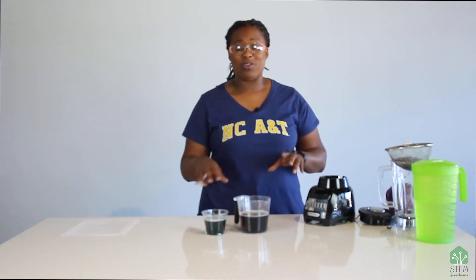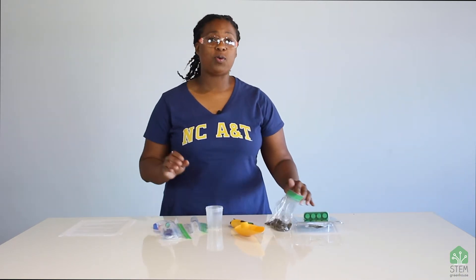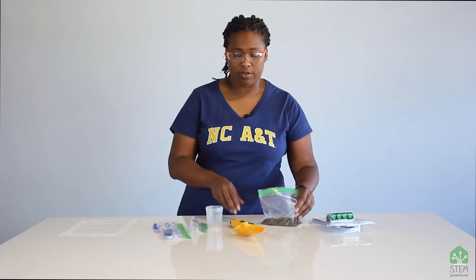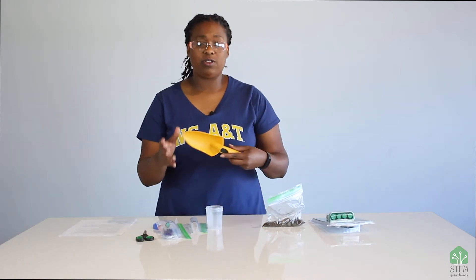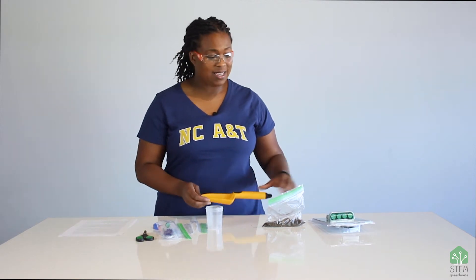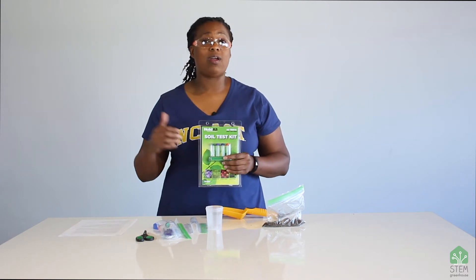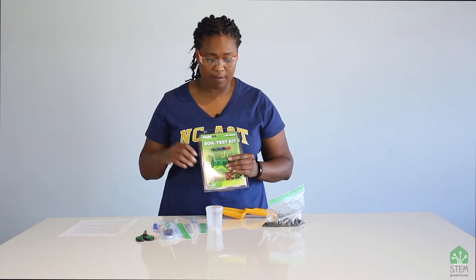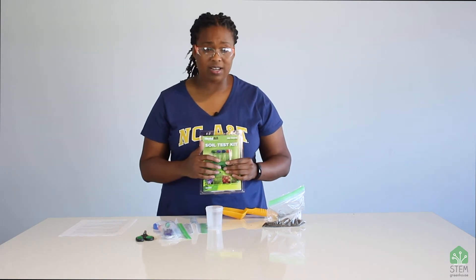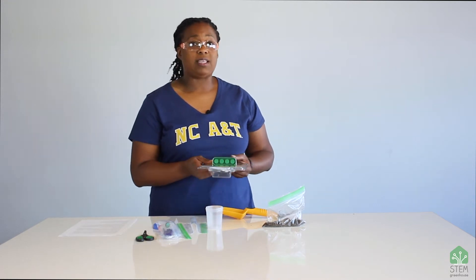Now we're going to do the soil testing. For our soil test, you're going to use a lot of things that come in your soil kit. First, you're going to have a little shovel to take a soil sample. What we're going to be testing the soil for today is pH or acidity, just like the cabbage juice indicator was. But we're also going to be testing for nitrogen, phosphorus, and potassium. Those are all nutrients that plants need to grow.